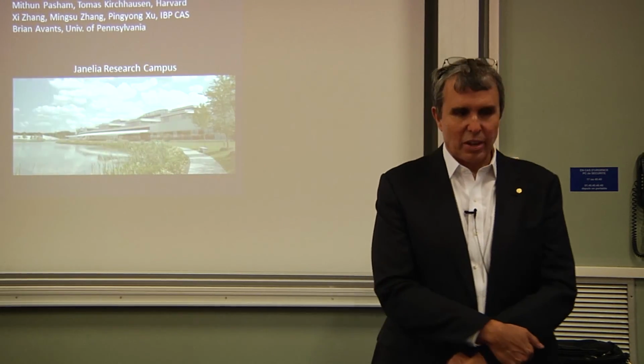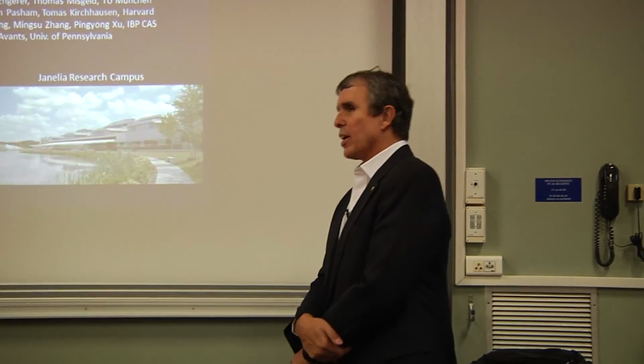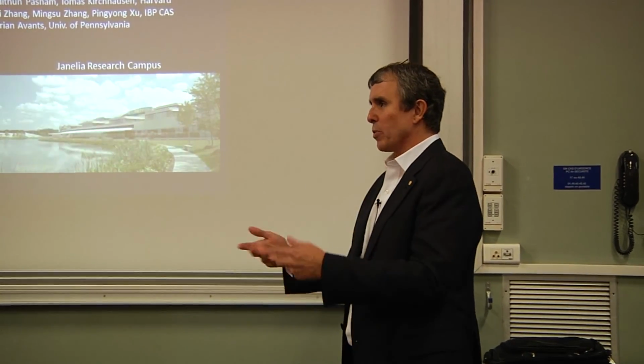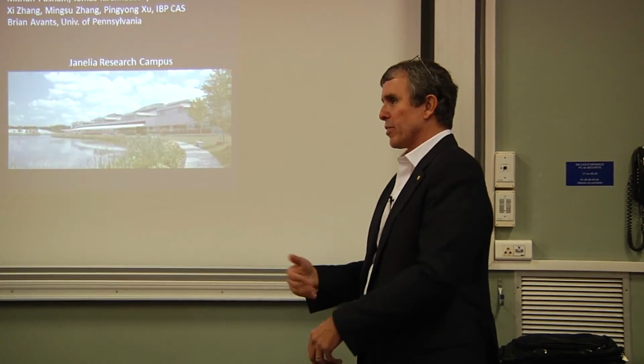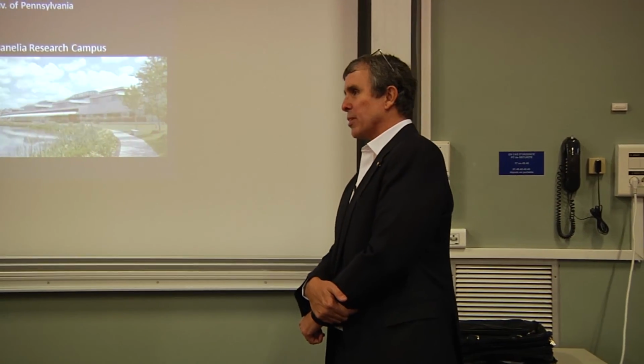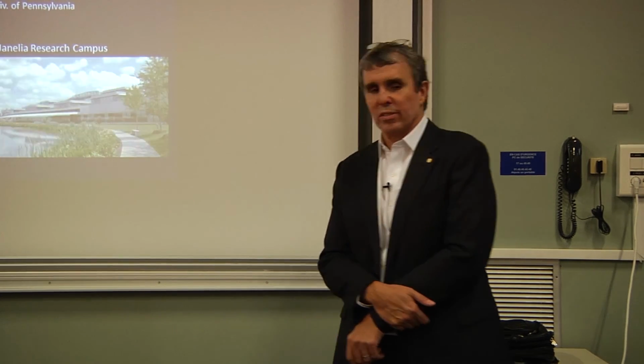Minimal processing, I'd say. I mean, SIM and localization, every super resolution method involves some processing in terms of getting the result. Not as sophisticated as what you do in the low SNR regime, say cryo-EM and the particle averaging and all the rest that goes on. Although that's a testament for how great image processing can be, because cryo-EM is in a revolution right now because of the cameras coupled with the image processing capabilities. But really what's needed is ways of handling the big data that we have.